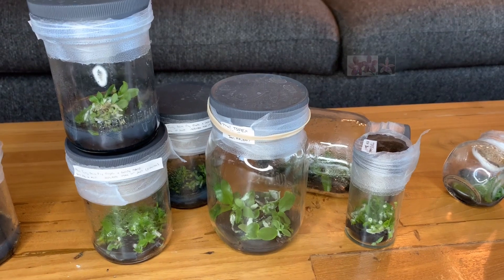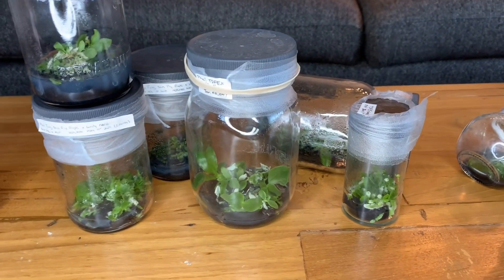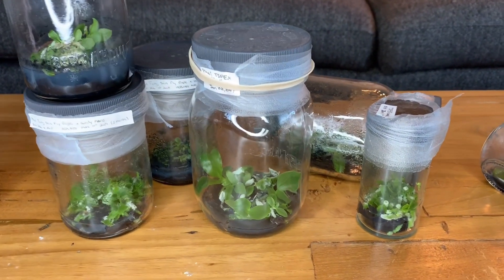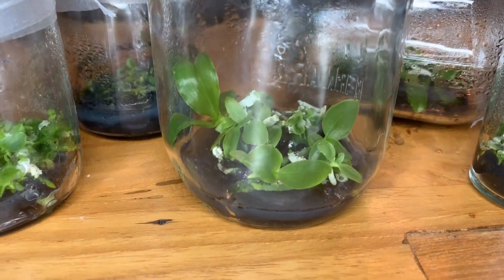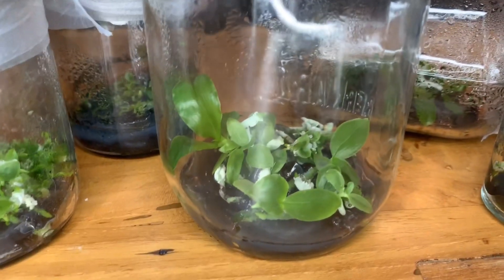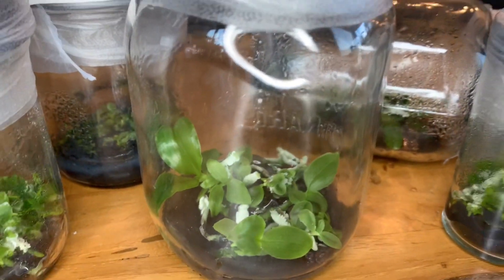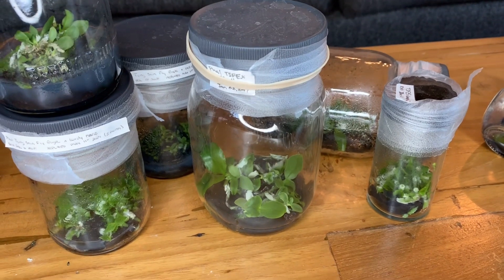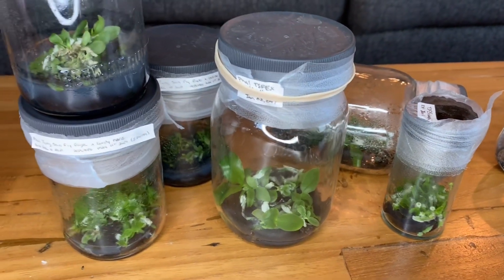This is the group that's Phalaenopsis Tying Shin Fly Eagle by Lovely Mary. You can see they're all in different states. Last time I had a bunch of the ones on the right, and I've actually de-flasked or replated a few of those into larger flasks. The one in the middle at the front with the largest seedlings I replated the longest time ago. It really shows the value of why replating is important — you distribute the media, plus you can thin them out and give them room to grow. Phalaenopsis also create volatile compounds, so if you don't replate them, you experience a slowdown in growth plus the nutrients get used up. The bigger ones are coming along well.